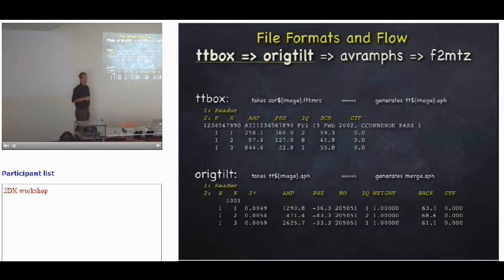And for all these, you have different file formats. Most of them are text files, ASCII files. Once you are in the MTZ format, it's a binary format, and you're dealing with floating point values. But here it's ASCII files, and there is the trap that if you write the ASCII files out as text, and you use sometimes 8-bit and sometimes 16-bit scanner and maybe others, floating point values, you have to watch out what kind of number you put down for the amplitude. If the number has only one digit left, 0.1 or 0.9, then you lose precision. And if the numbers are longer than the digits you have, then you may just mess this up, and suddenly the amplitude writes into the K vector and your programs crash.